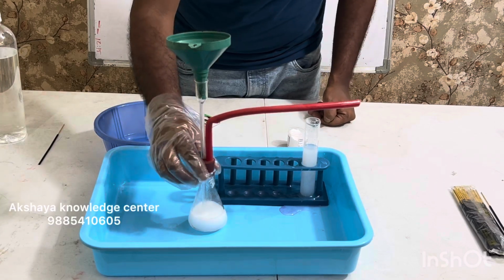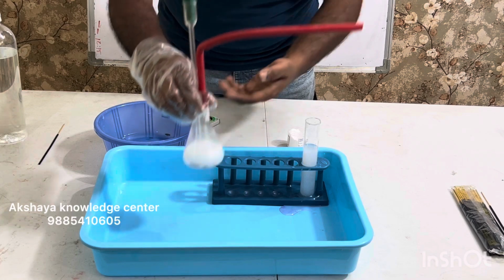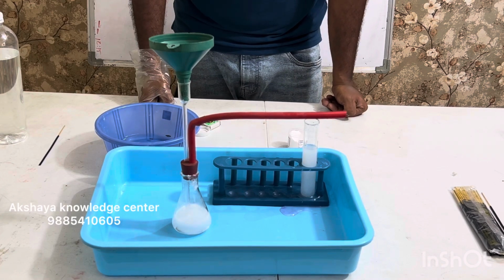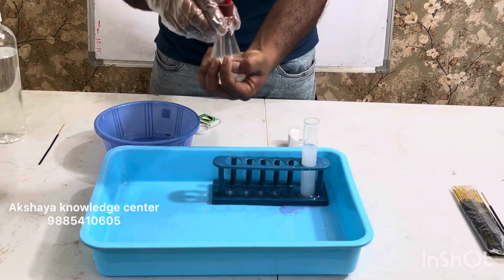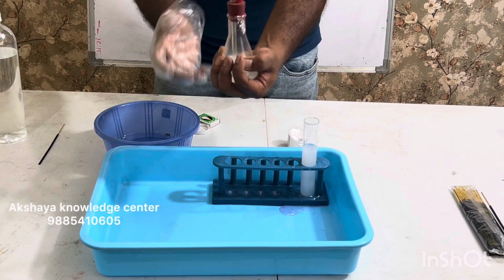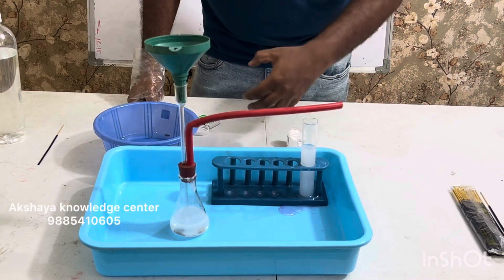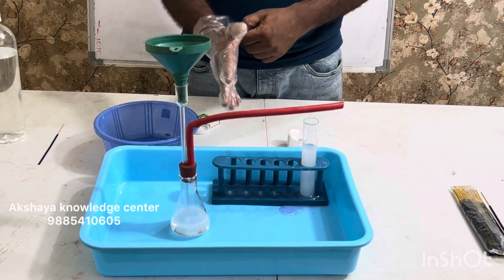And another observation is, if I touch this particular end, it's actually cold. The coldness indicates it is an endothermic reaction. The previous experiment with hydrochloric acid was exothermic. Here it is endothermic. That means this beaker is taking heat from my body. My hand is becoming colder. That's what endothermic is. Endothermic reactions absorb energy. Exothermic reactions push out energy. So with that we are done with the experiment. I hope you understood the results.